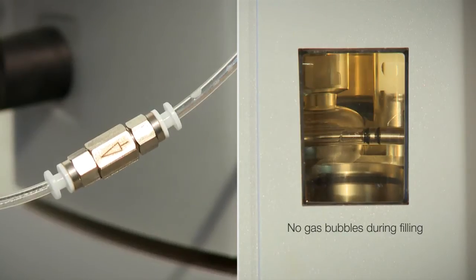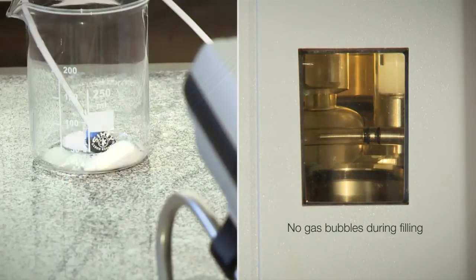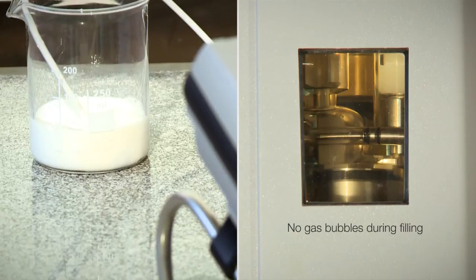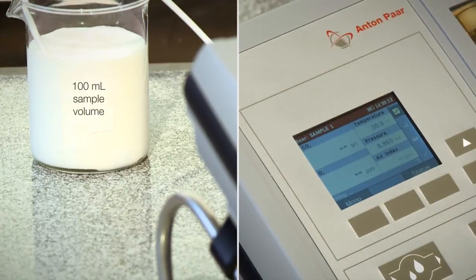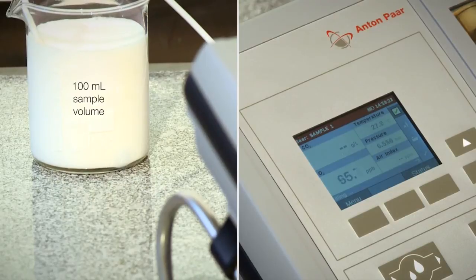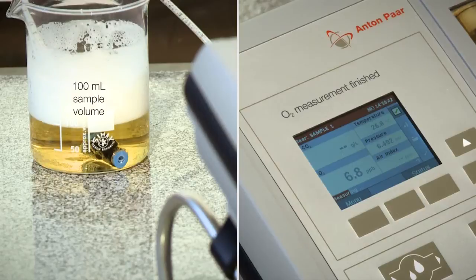While the instrument is rinsed and filled with sample, make sure that no gas bubbles are visible in the measuring chamber window. Use 100 milliliters of sample for the measurement. As a first step, the O2 measurement is performed.